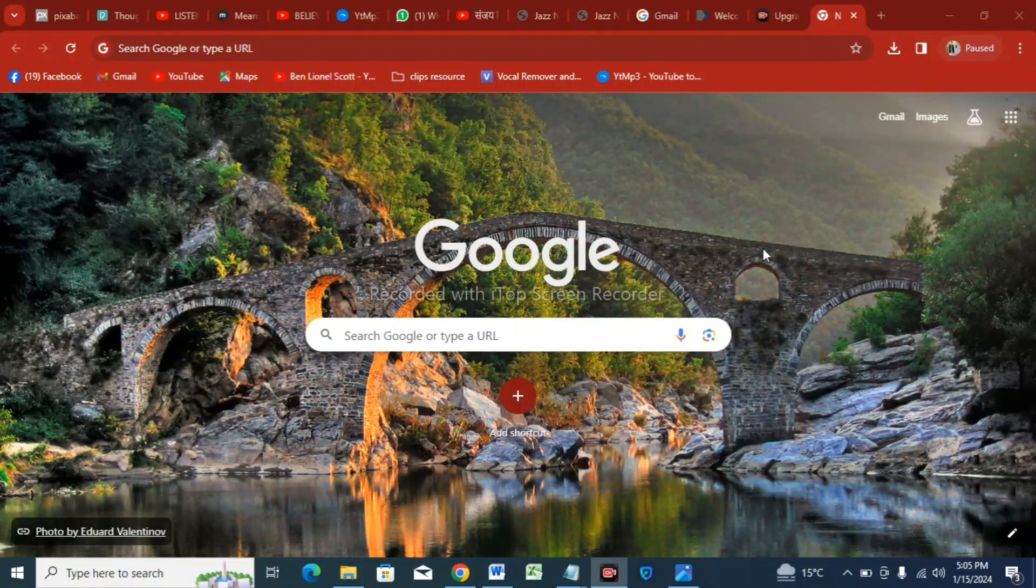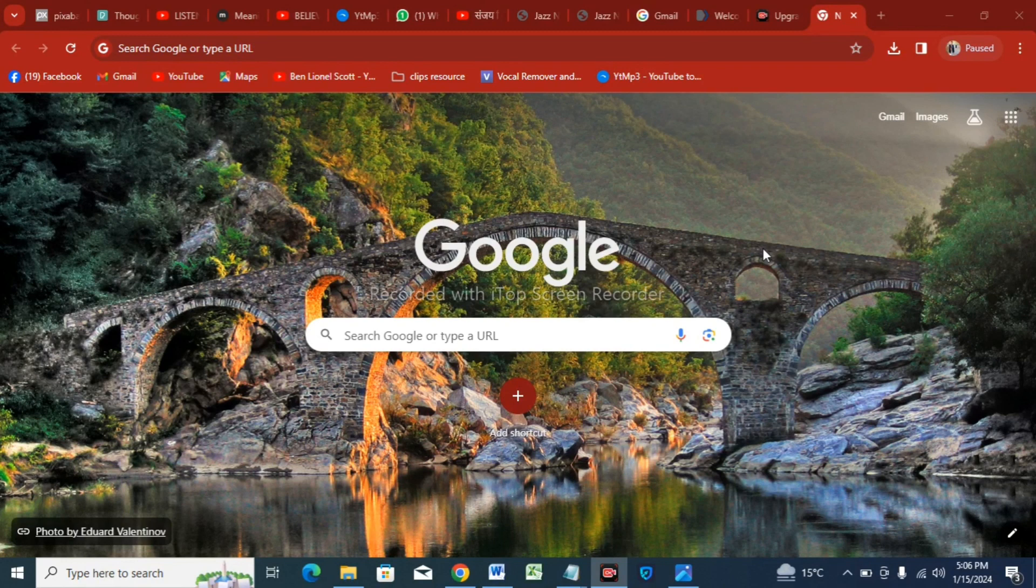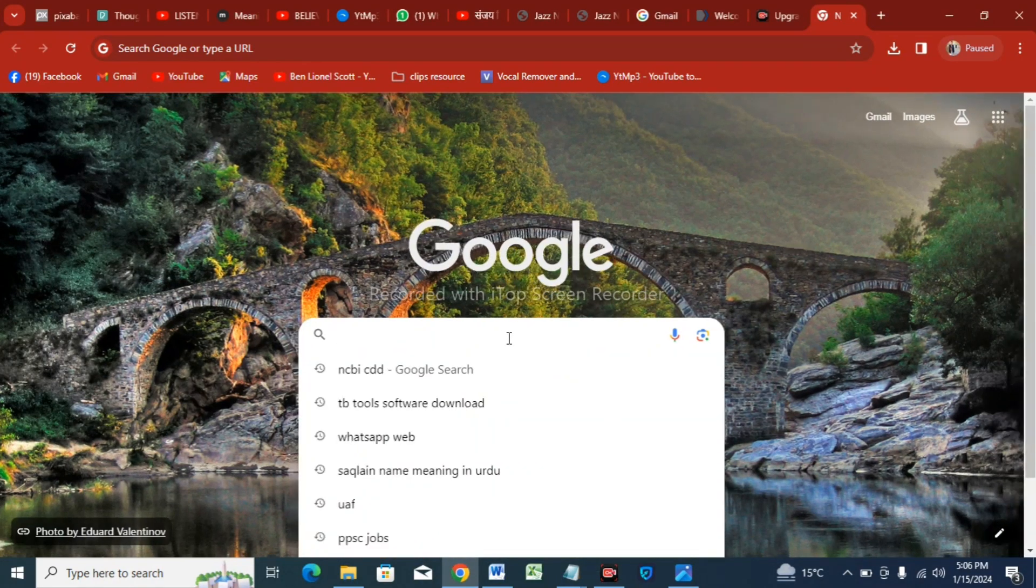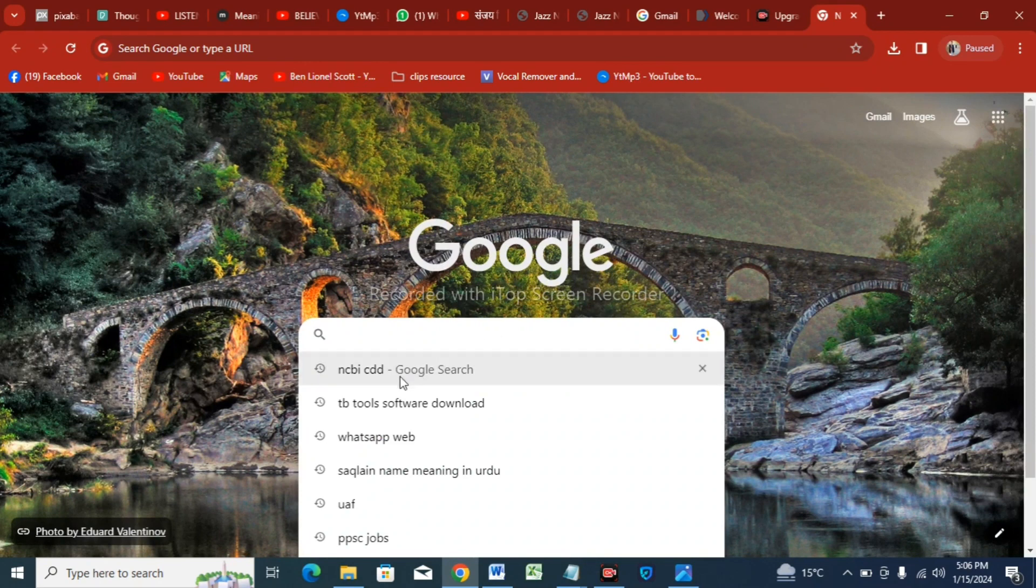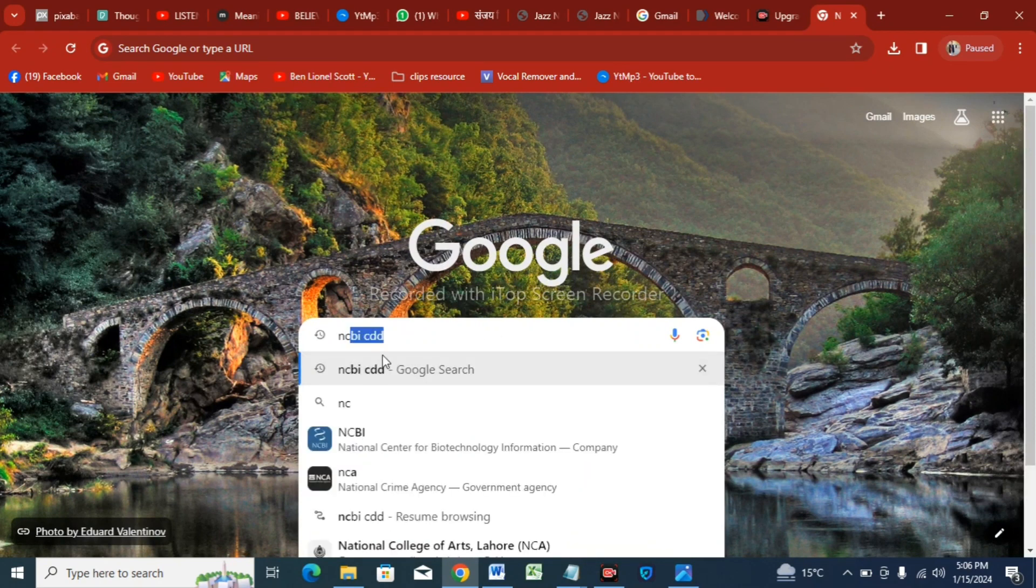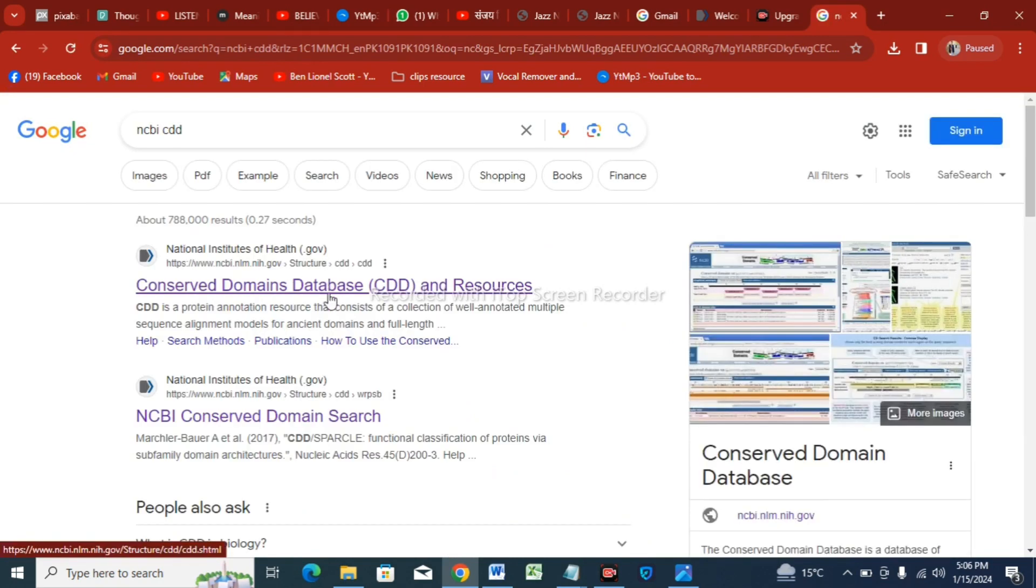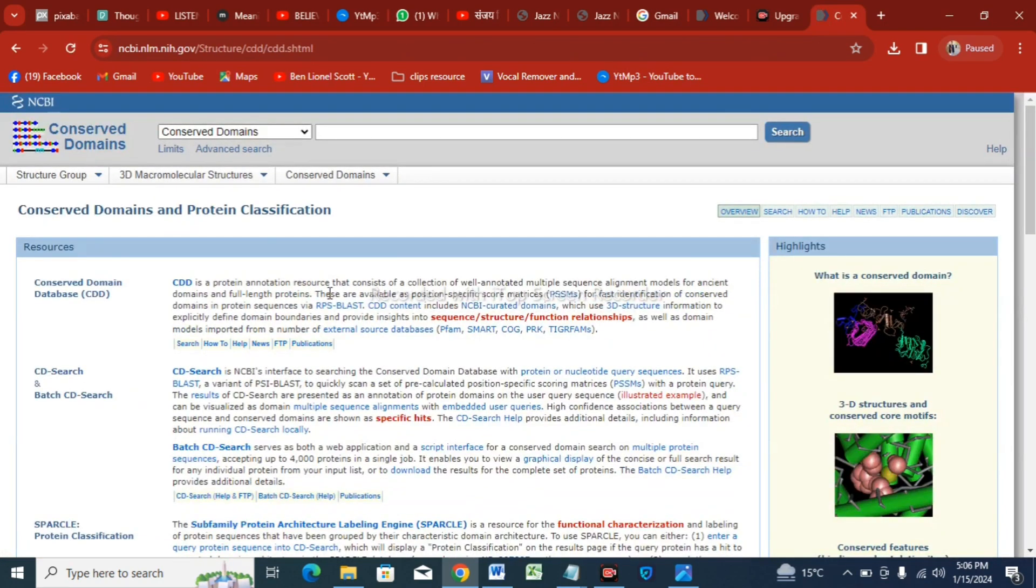My assigned task is how to make a conserved domain of a non-protein sequence. For this, we have to first of all open Google Chrome or any other search engine and search NCBI CDD. Tap on this, then tap on the first option, Conserved Domain Database, and then tap CD Search.